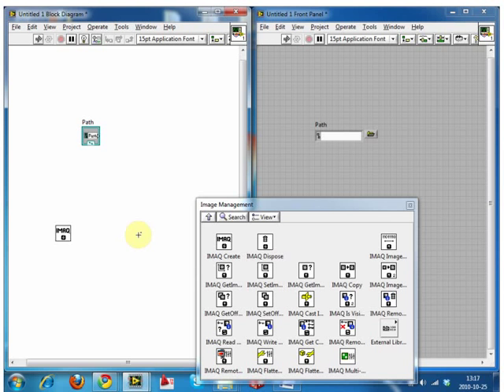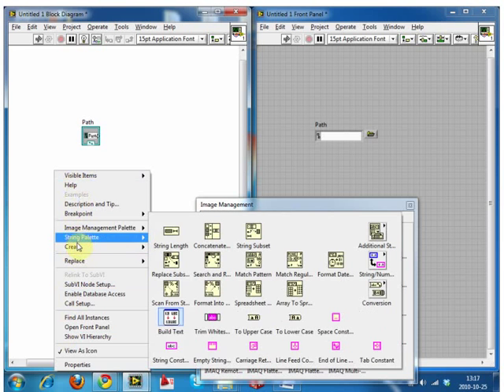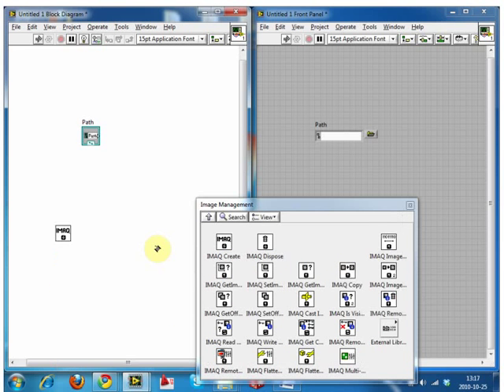Okay. So we now need to give this a name. If you hover over it, you'll get all these colored dots which come up, and the image name is just up here. We hover over this little dot, we have a little wire spool, and if you right click, then you should get this list pop up. Go to create and constant. Everyone should have something called untitled. And you can just go ahead and rename that whatever you want to, ROI image. It doesn't really matter as long as it's a unique name.